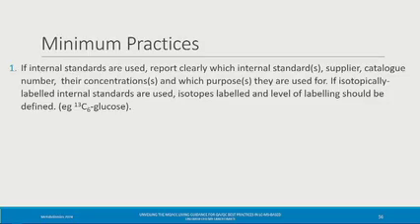Yeah, so I also would like to highlight a less widespread use of internal standards for the metabolomics community, which is quite popular in exposomics or among environmental people, and this is namely mass recalibration using internal standards. So maybe this will also be some time point to introduce this workflow, because in fact when we are working with a mass spec, especially with, let's say, lower or medium grade, we need to recalibrate our data to provide the best possible quality.